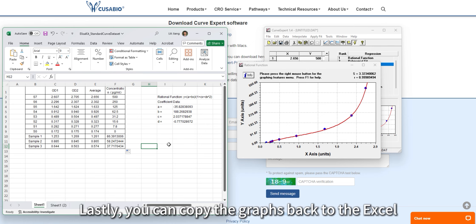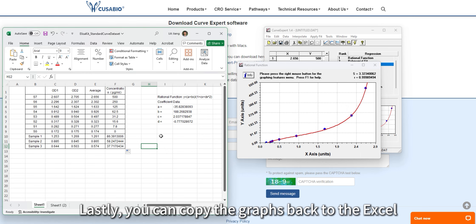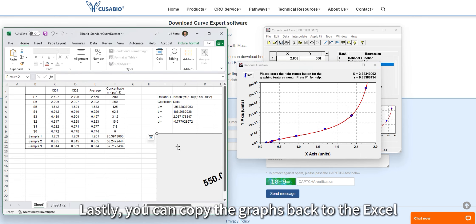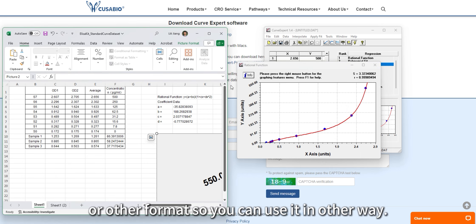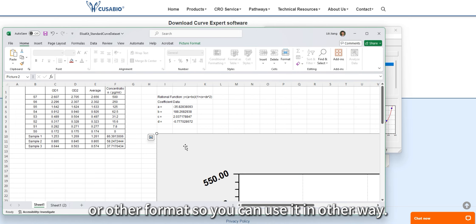You can copy the graphs back to Excel or other formats so you can use them in another way.